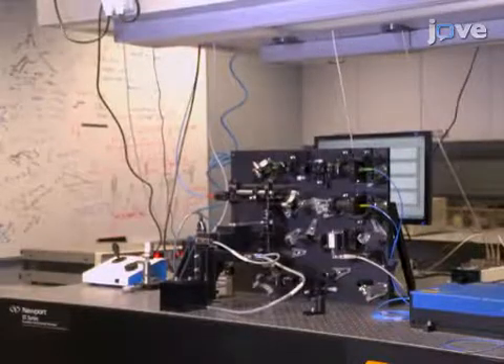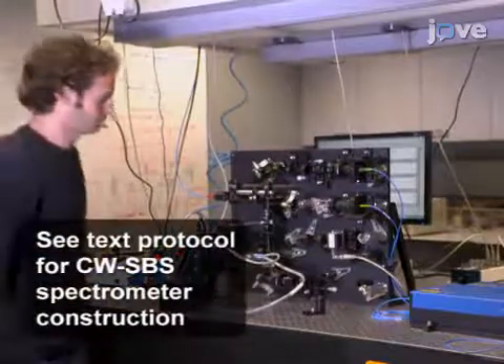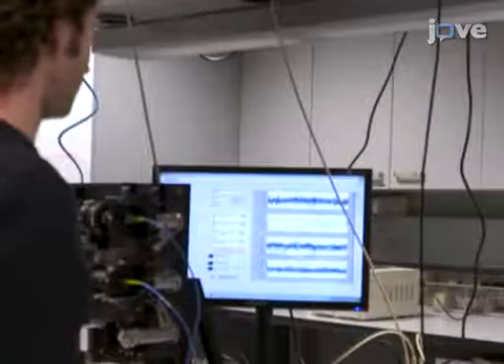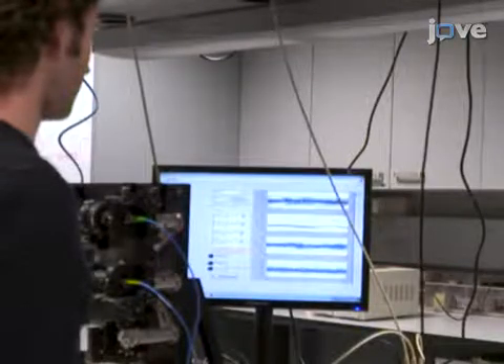To begin the experiment, verify that the components of the CWSBS spectrometer are securely mounted on an optical board. Check that the custom data acquisition software is receiving data from the microwave frequency counter, the lock-in amplifier, the pump and probe laser controllers, and the function generator.